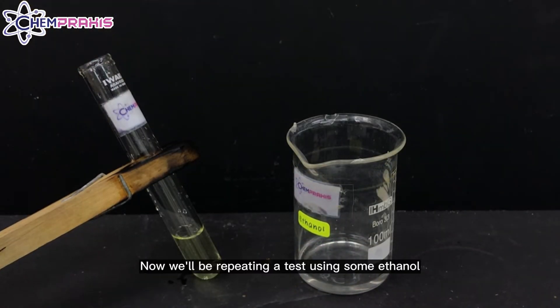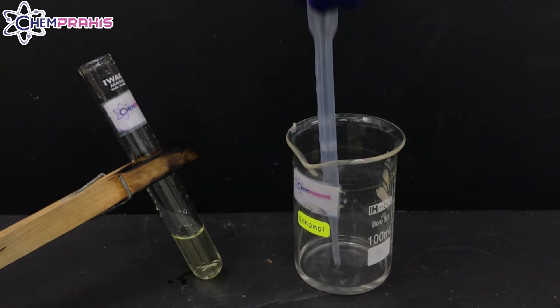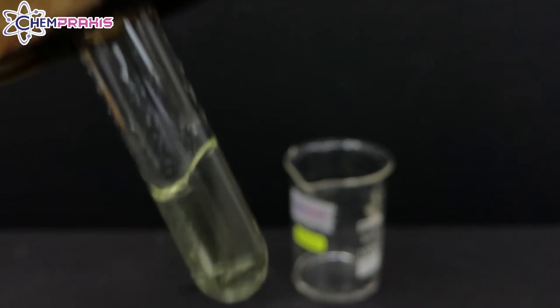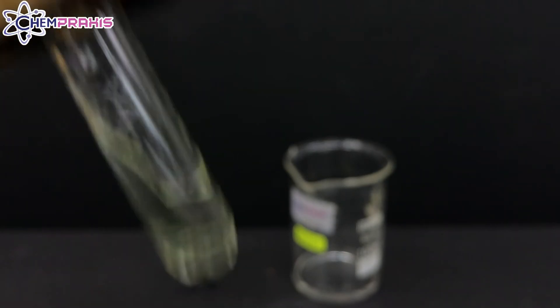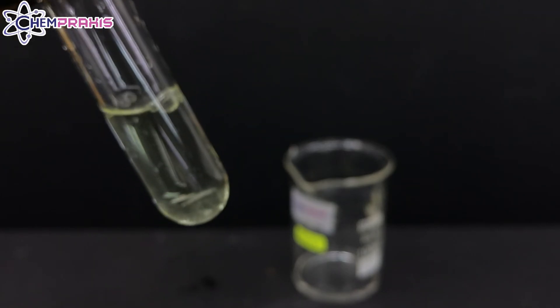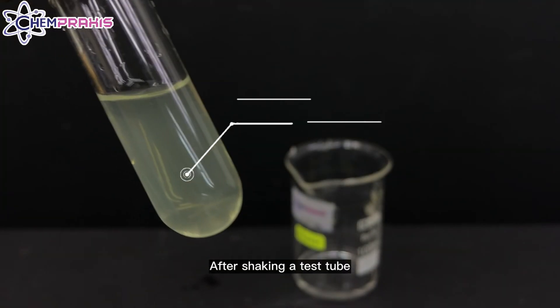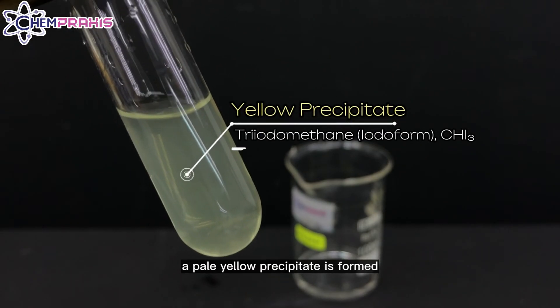Now we'll be repeating the test using some ethanol. After shaking the test tube, a pale yellow precipitate is found.